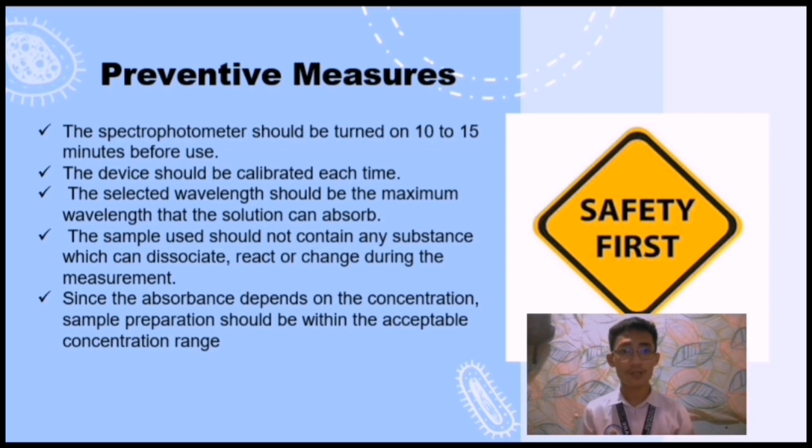Then, the sample should not contain any substance which can dissociate, react, or change during the measurement. And lastly, since the absorbance depends on the concentration, sample preparation should be within the acceptable concentration range. And that's all for the preventive measures when using the spectrophotometer.